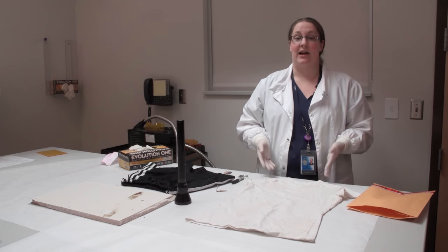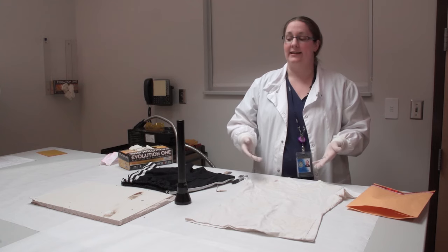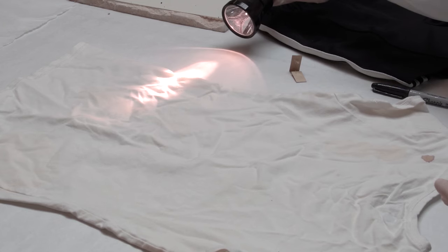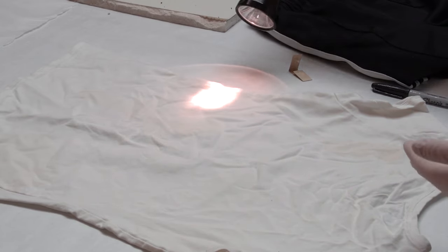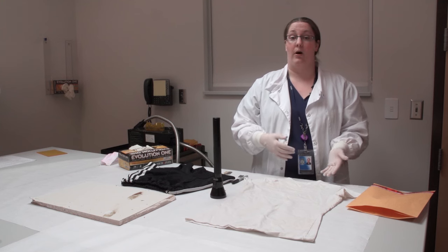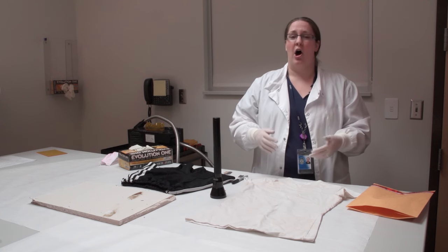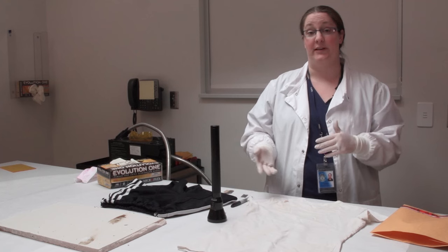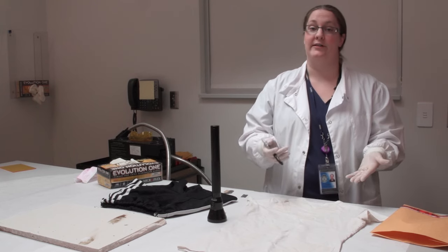Another lighting technique we might use if you cannot visualize a stain with your naked eye is oblique lighting - simply taking a normal flashlight and lighting whatever item you're looking at from the side. Sometimes this makes a stain pop out to your eye in a slightly different color, especially on an item where you might have a red blood stain on red cloth or a darker fabric like black or brown. That little bit of difference in side lighting will make the stain pop out, almost like it's wet in appearance. Any stains you can see - either with your naked eye or oblique lighting - I'll go ahead and mark those as possible stains to test later.